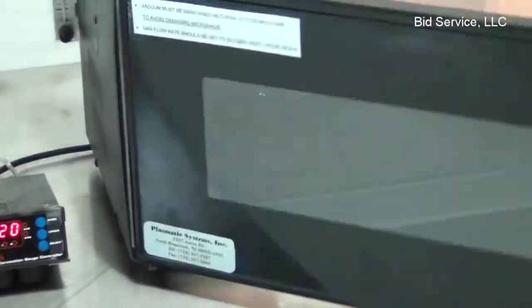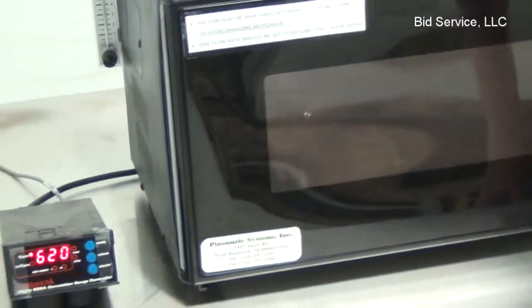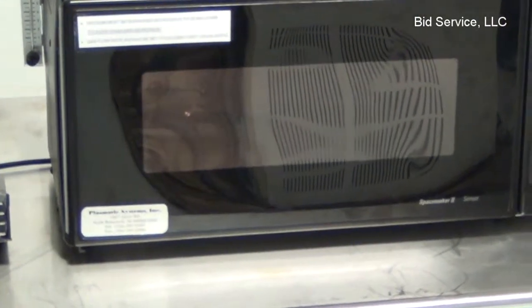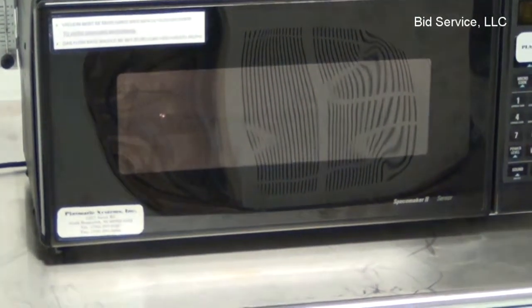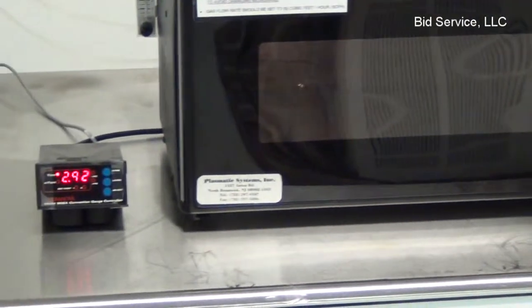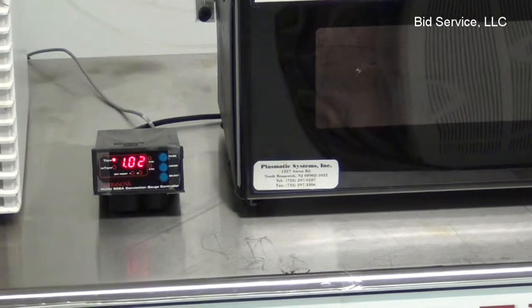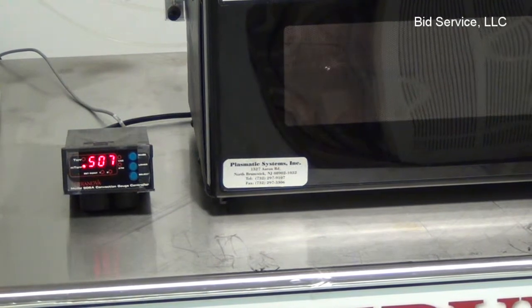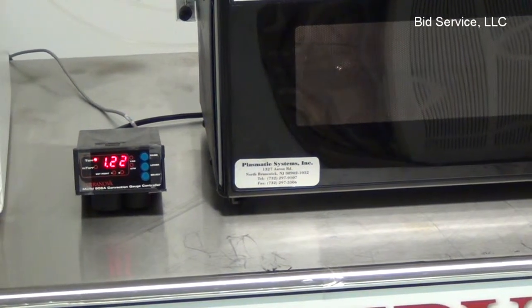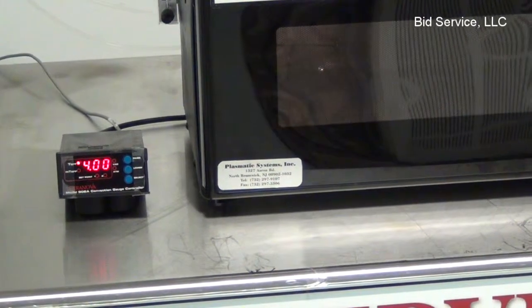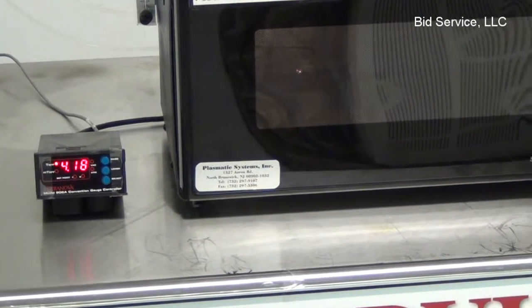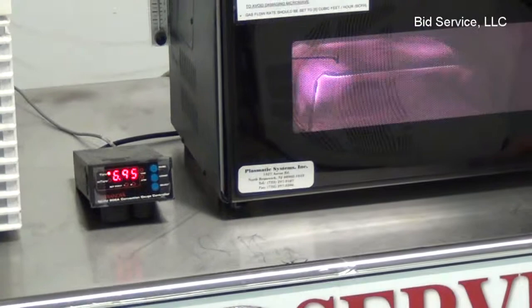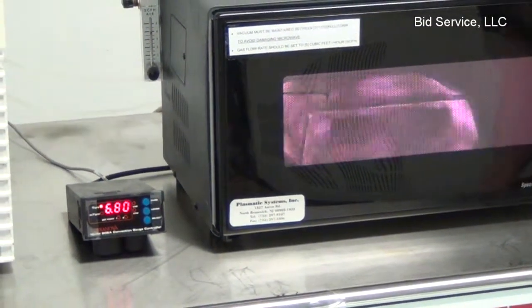You can use the control cable as well. Close the lid. Close the door. Turn on the gas. Pump it down into range. That's good, and once again press the button.